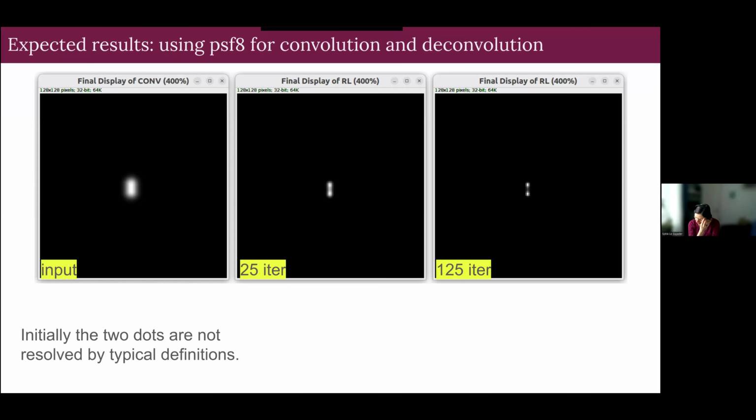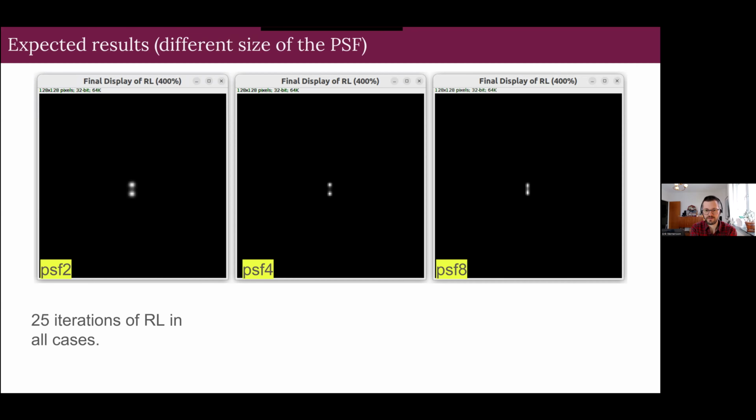So it means you would never recommend using an artificial PSF? Depends. So for FISH dots, RNA or DNA FISH, the artificial works very well because most of interest is quite local. But if you want to deconvolve, for example, nuclei or even thicker samples, more complex things, then maybe widefield isn't the right technique to start with because all samples are optically active. So the PSF will vary across the image depending on where you are.